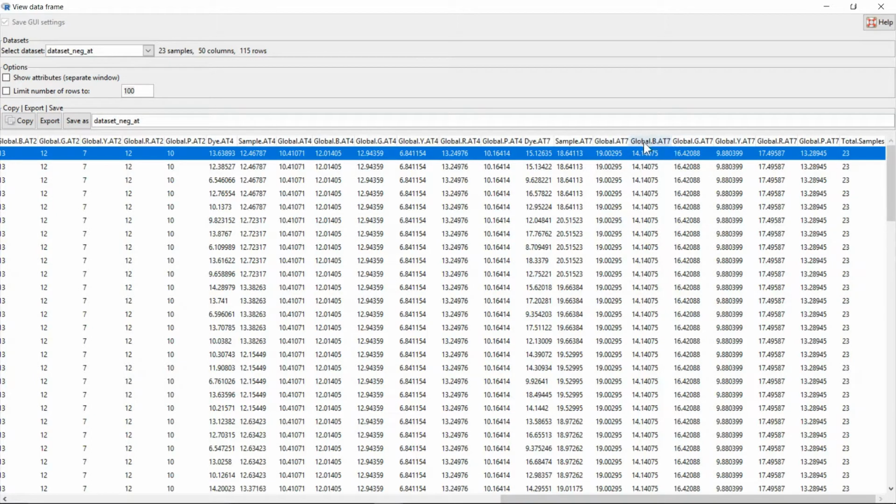And the dye-specific ATs are different for different dye channels. Here, actually, the yellow channel has the least noise, and the red has the most noise. But the most conservative overall here is the global value.